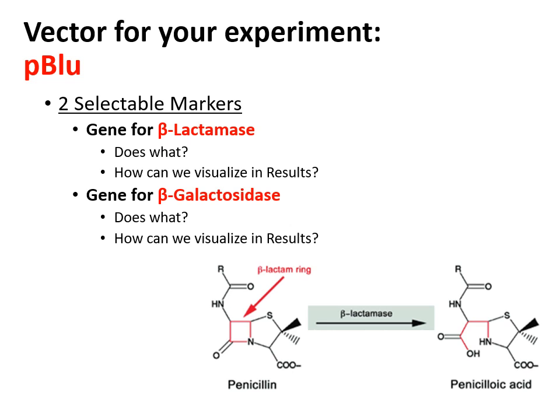Now, what scientists did was they created a fake or a special kind of sugar molecule called X-gal. So it's the letter X, G-A-L. And X-gal, when that is cut in half by beta-galactosidase, one of those halves has a blue color to it, okay? So beta-galactosidase allows us to visualize which bacteria took in pBlue and are successfully working with this DNA based on which bacteria turn blue in the presence of X-gal.